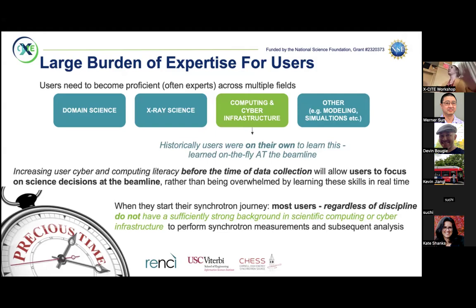You also probably, as a user, need to understand and be an expert in other types of modalities. Maybe it's modeling, simulation, something complementary to your X-ray piece. But in order to use synchrotron data, especially in this day and age, you also need to be very strong with computing and cyberinfrastructure. Our data is very large. It's on very complex systems.